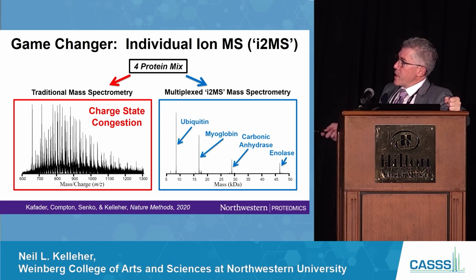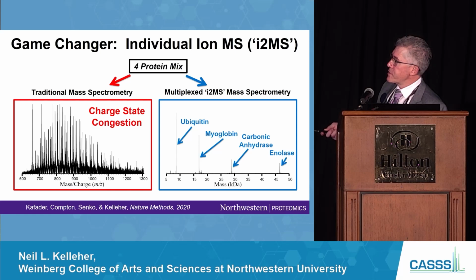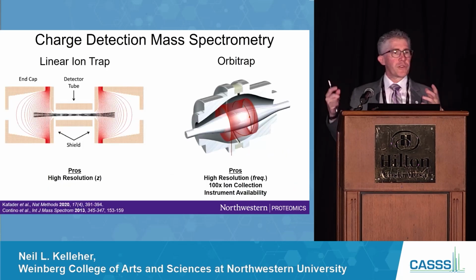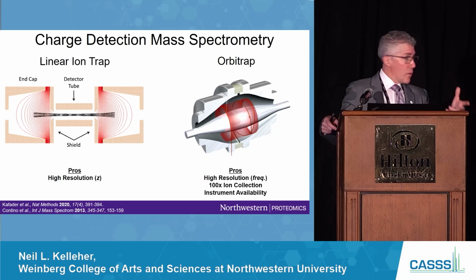But now I want to take the same mixture, and there it is. It's in the mass domain. You now have a much flatter baseline, and let me tell you how this thing works. It directly spits out mass above 6+, so it has a floor of about 5 kilodaltons, and that's because it uses charge detection. And this is something that AAV people know a lot about.